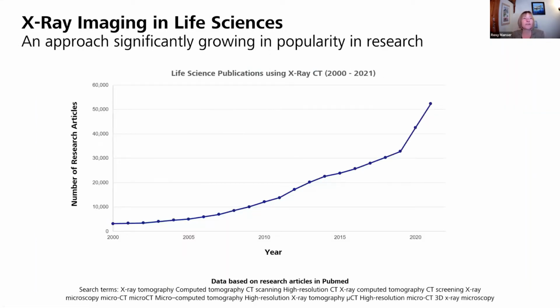And actually, if you look over the number of publications that are coming out of life science in particular using X-ray technology, this is over the last 20 years or so, and I just pulled this from PubMed using a number of different search terms around X-ray imaging. There's been a huge uptick, particularly in the last 10 years, of research publications invoking X-ray technology. And this really shows a combination of things. It's the sample strategies and how you actually put these experiments together that have developed. It's also the technologies themselves that are showing themselves to be very powerful for providing different scientific insights. So it's an exciting time for the technology area, and it's also an exciting time for a number of different application spaces that are making use of this non-destructive technology.